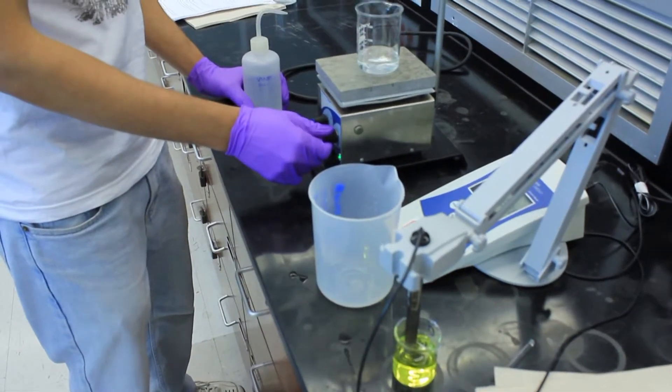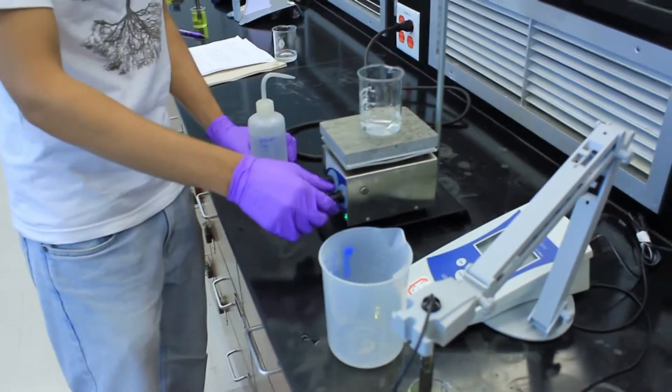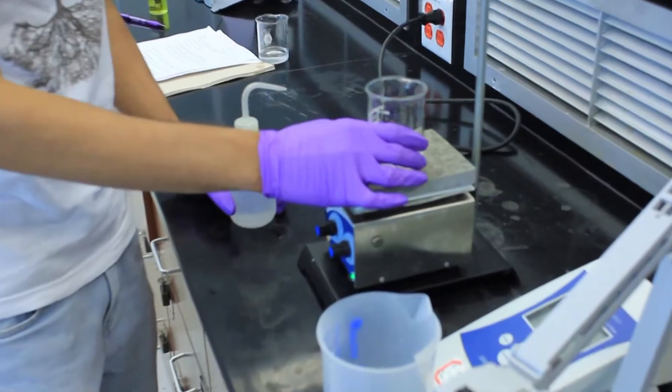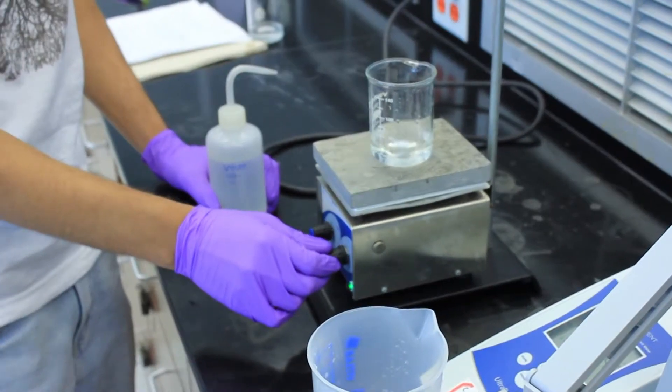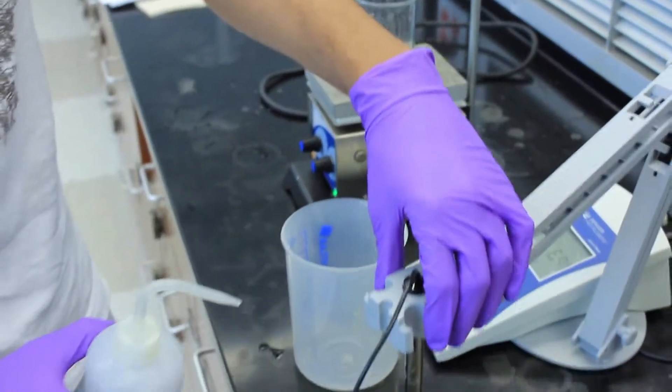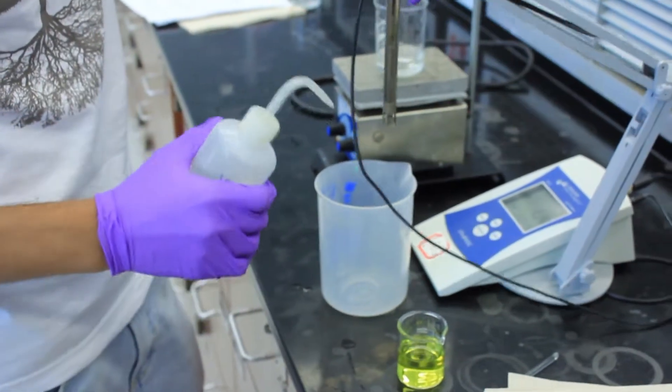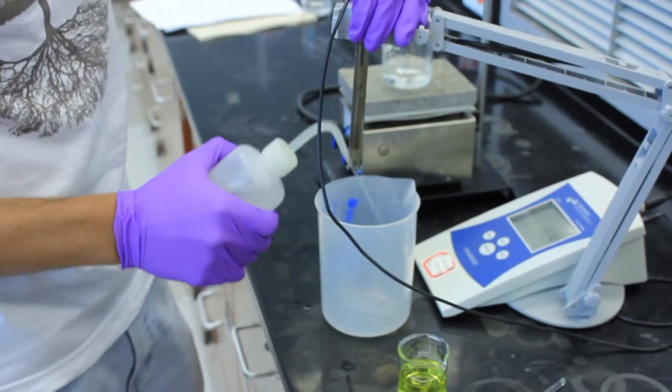Go ahead and start the stir motor and get it to a steady pace where the water is washing around. Take the pH meter and make sure you rinse it.